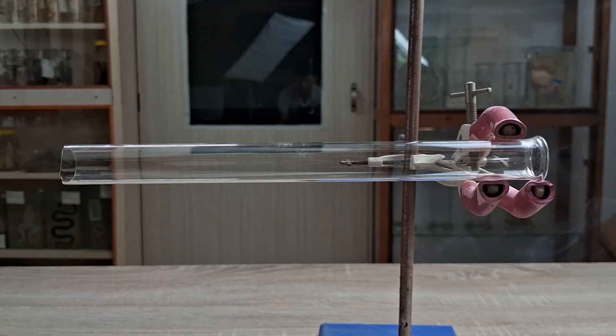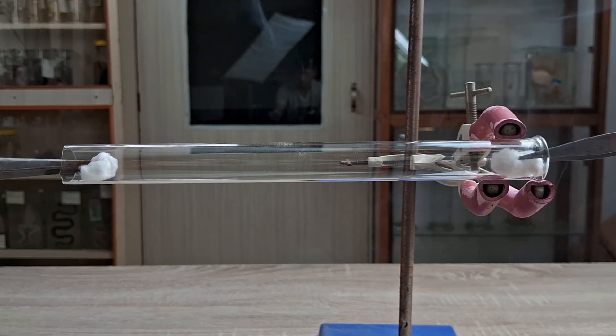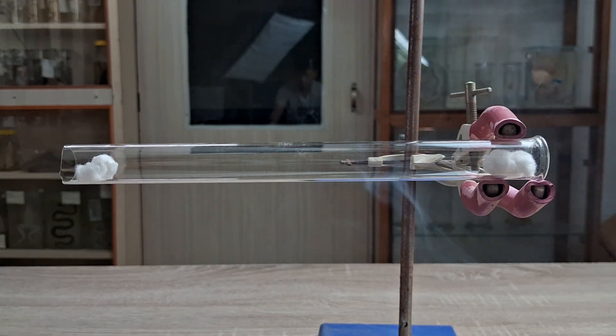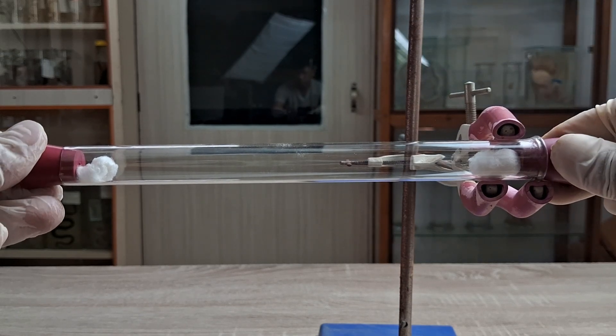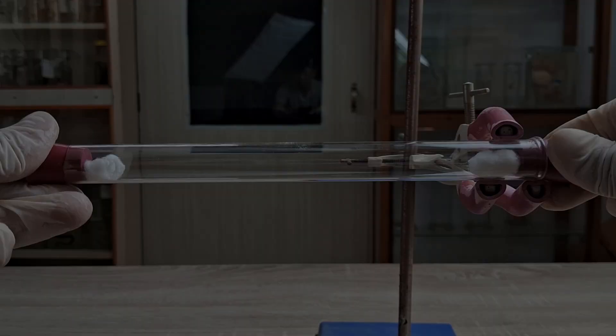Introduce the two cotton balls, one on each end of the glass tube, at the same time. Stopper the open ends of the tube with the rubber corks, also at the same time. Allow the setup to remain undisturbed and observe closely.